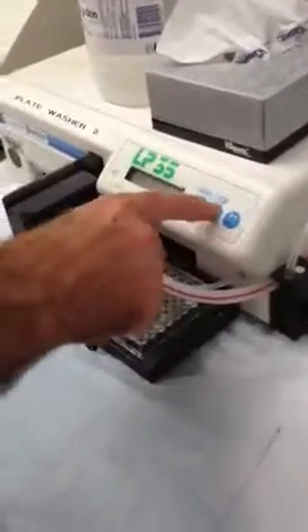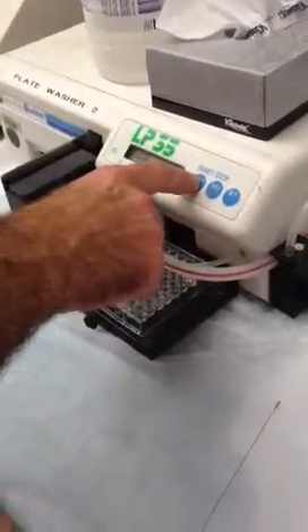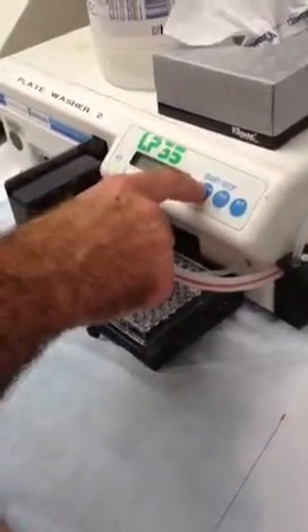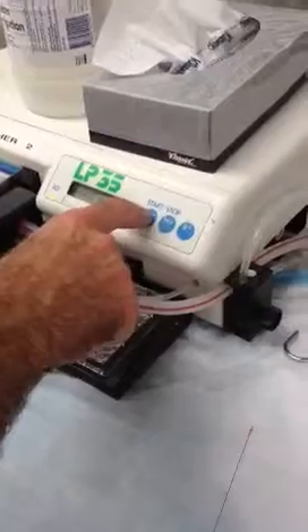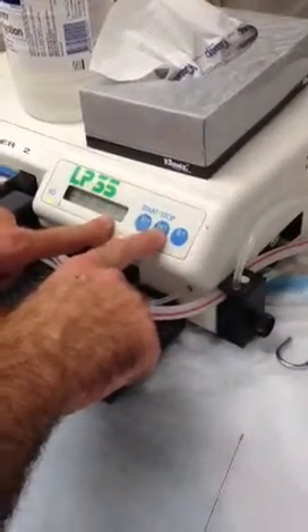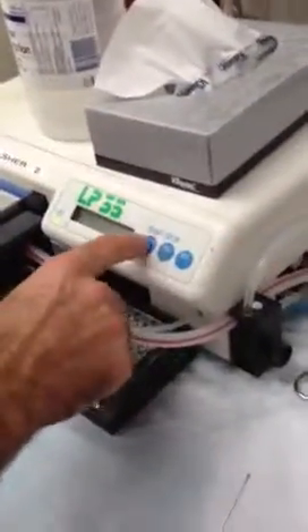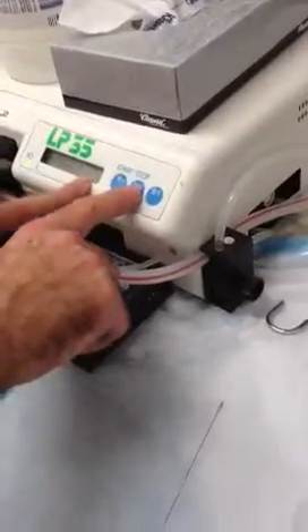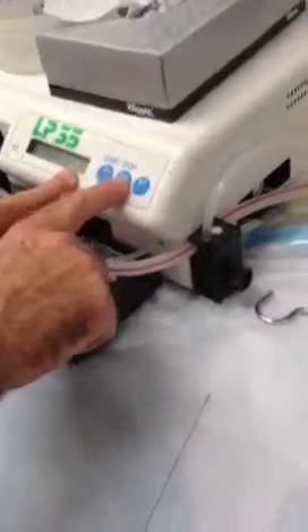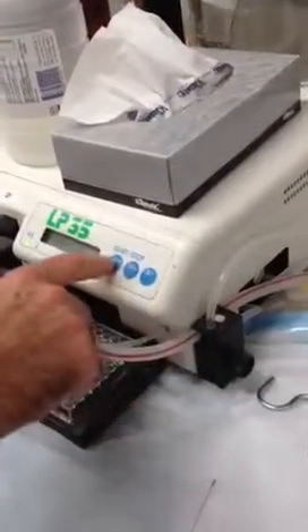The only other thing to remember is that the arrows are the wrong way. So if you're on seven and you go down, you'd expect six but it actually goes to eight. Same with cycles — if you go down from three, you expect two but it actually goes to four. Other than that it should be okay. Thanks, that's it — you can have that one.